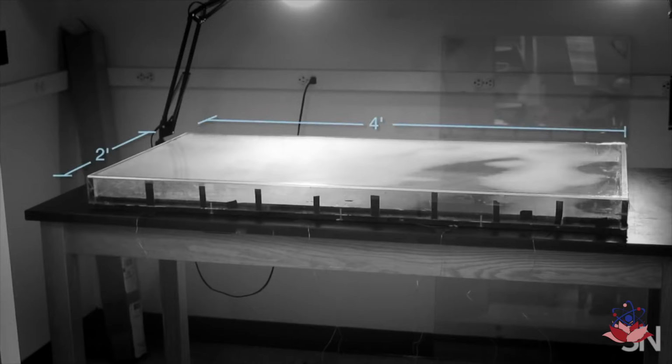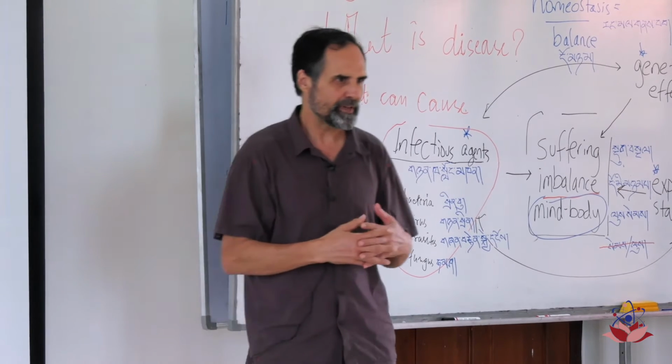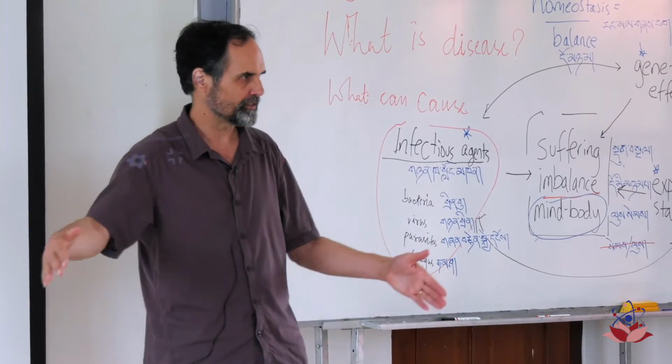It's 2 feet by 4 feet. And the way we set it up is that there are 9 bands, and at the base of each of these bands, we put a normal Petri dish thick agar with different amounts of antibiotic. On the outside, there's no antibiotic. Just in from that, there's barely more than the E. coli can survive. Inside of that, there's 10 times as much, 100 times, and finally, okay, so it's a big plate of agar, right?